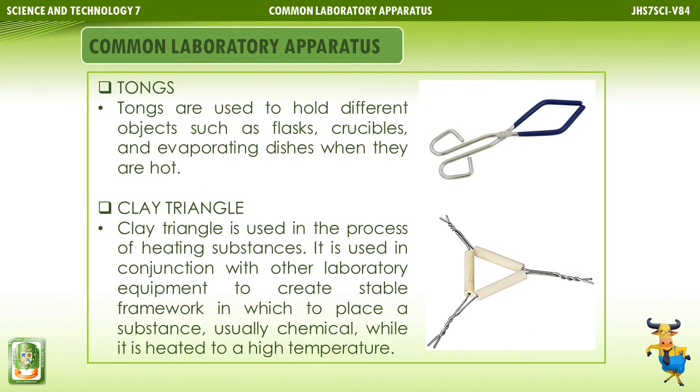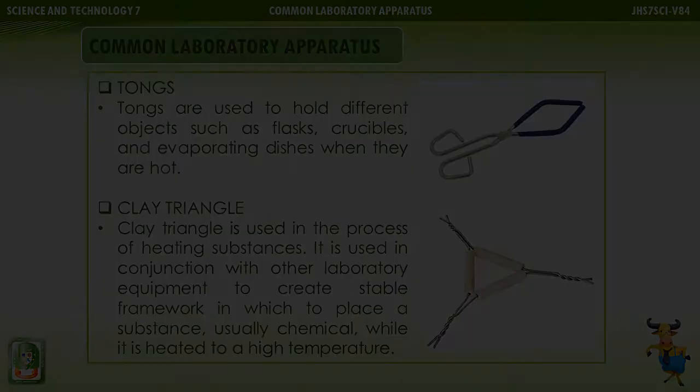Clay triangle. Clay triangle is used in the process of heating substances. It is used in conjunction with other laboratory equipment to create a stable framework in which to place a substance, usually chemical, while it is heated to a high temperature.